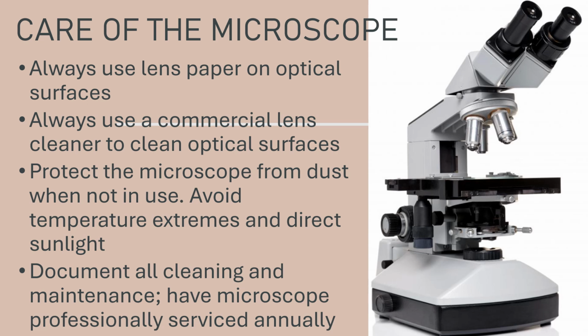Again, check the light source, the condenser alignment, and objective lenses. Inspect your mechanical stage movement, and also the fine and coarse adjustment knobs. Cover your microscope when not in use. And annually, again, have the microscope serviced by a professional.